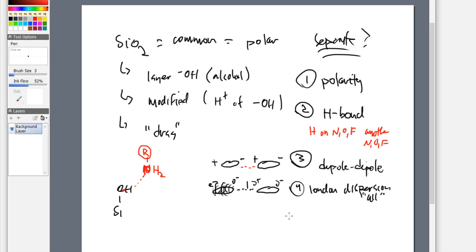Next up, another thing that can happen here, number 5, is pH. These molecules are pH dependent, and the separation is also pH dependent. So I'm going to give you an example here. One of the things that we will probably do in the course, if you've not done it already, is a paper chromatography of amino acids.